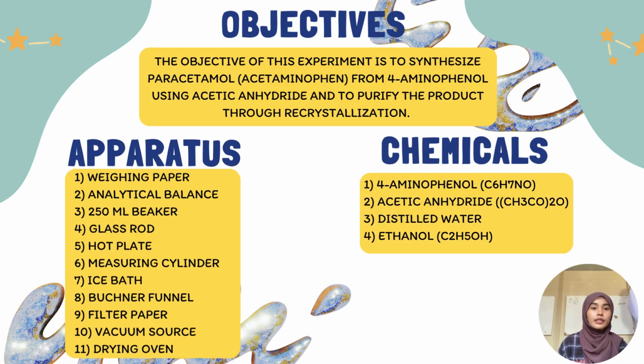Then the objective of the experiment is to synthesize paracetamol (acetaminophen) from para-aminophenol using acetic anhydride and to purify the product through recrystallization. The process involves forming paracetamol crystals and isolating them by filtration.